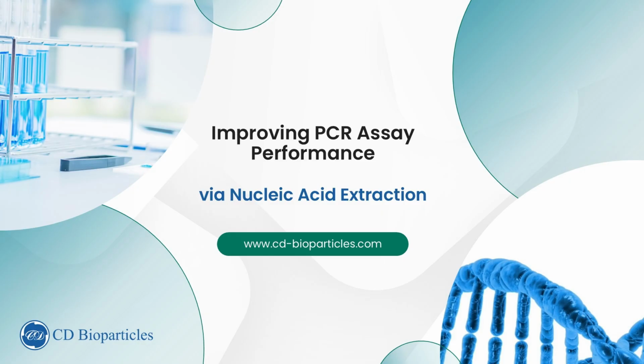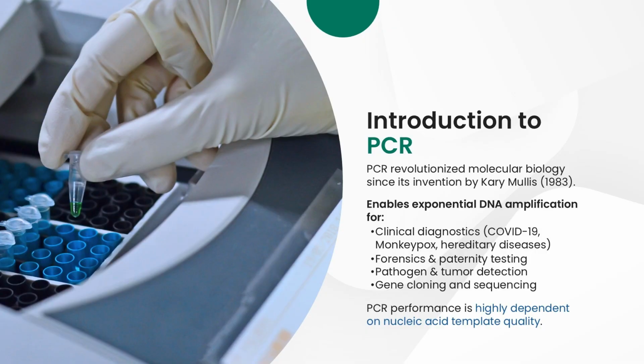laboratory workflows. Before we dive into extraction methods, let's briefly review why PCR itself is so important. Polymerase chain reaction, or PCR, has been a cornerstone of molecular biology since its invention by Dr. Kary Mullis in 1983. It enables exponential DNA amplification and has broad applications in diagnostics, forensics, and gene analysis. From identifying genetic fingerprints in forensic cases, to detecting infectious diseases such as COVID-19 and monkeypox, PCR is essential in both research and clinical laboratories.